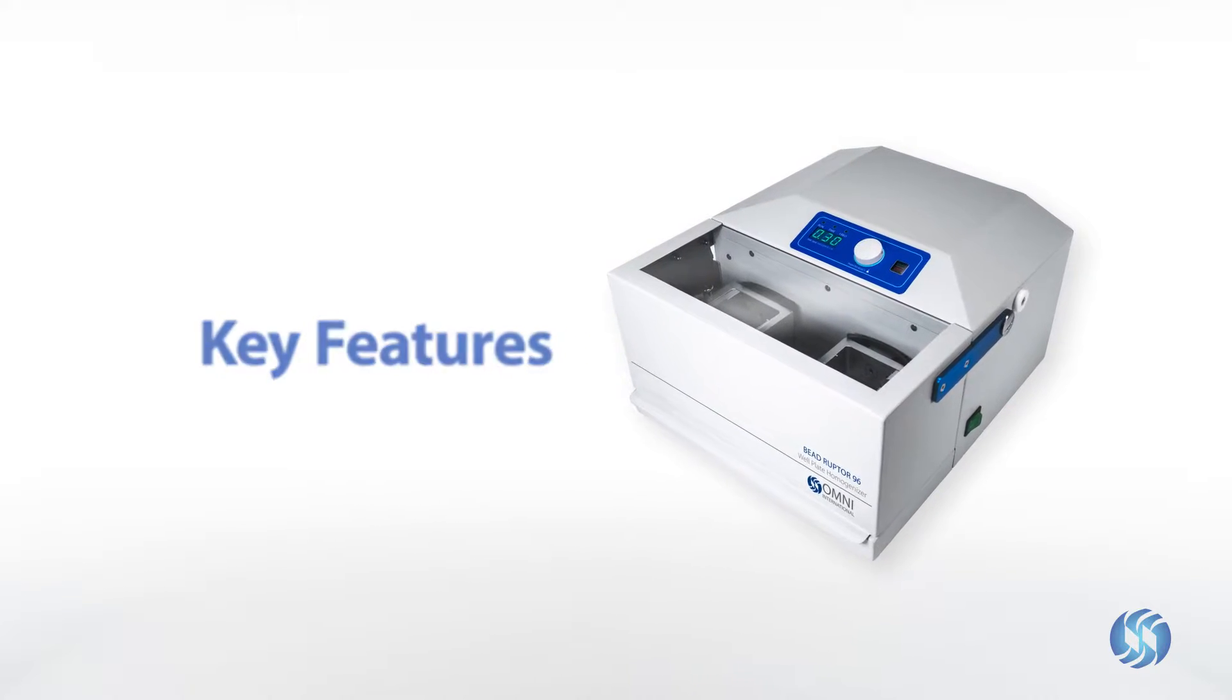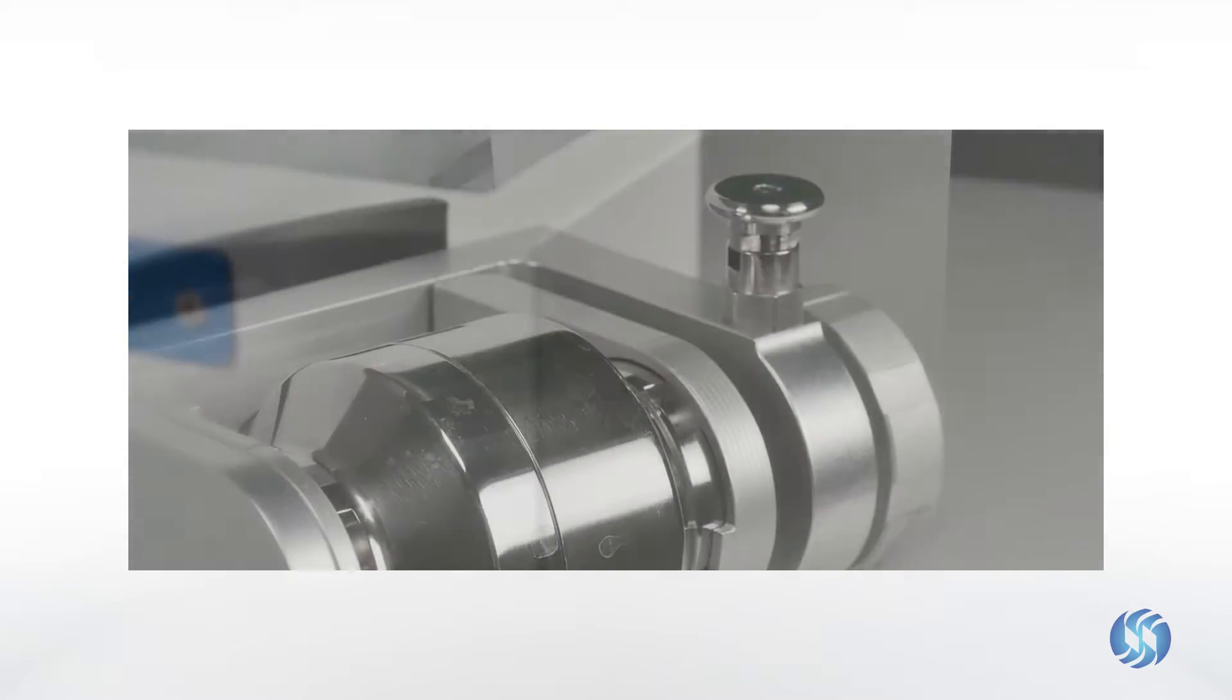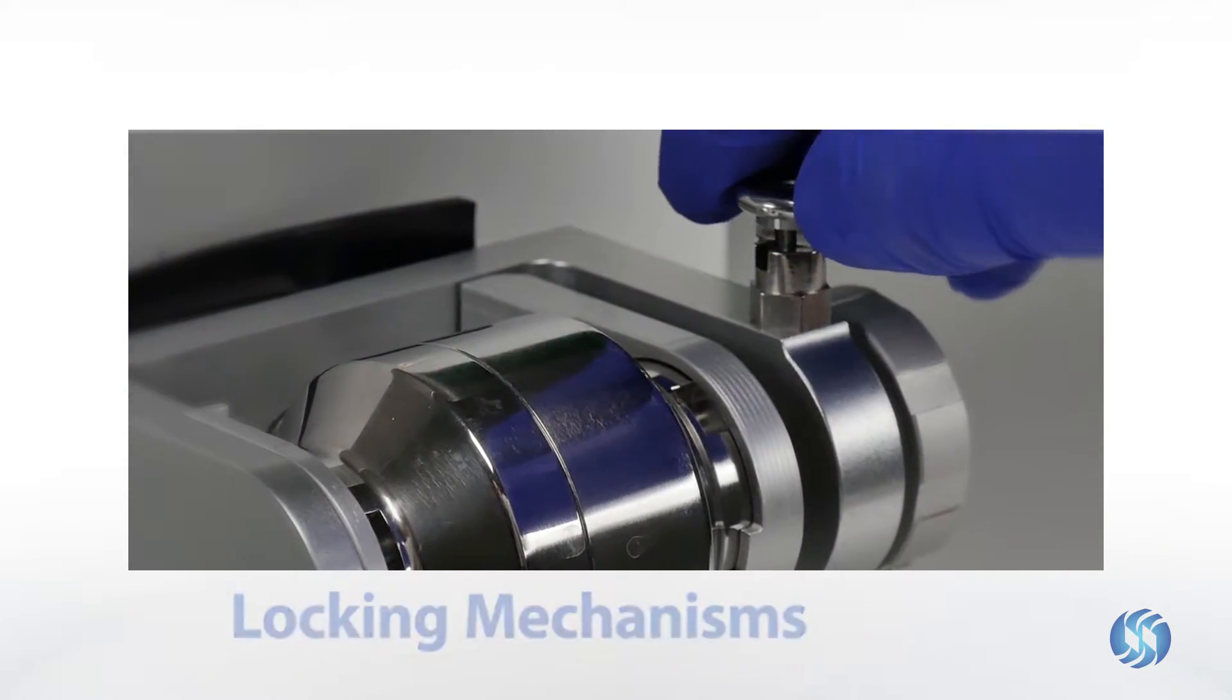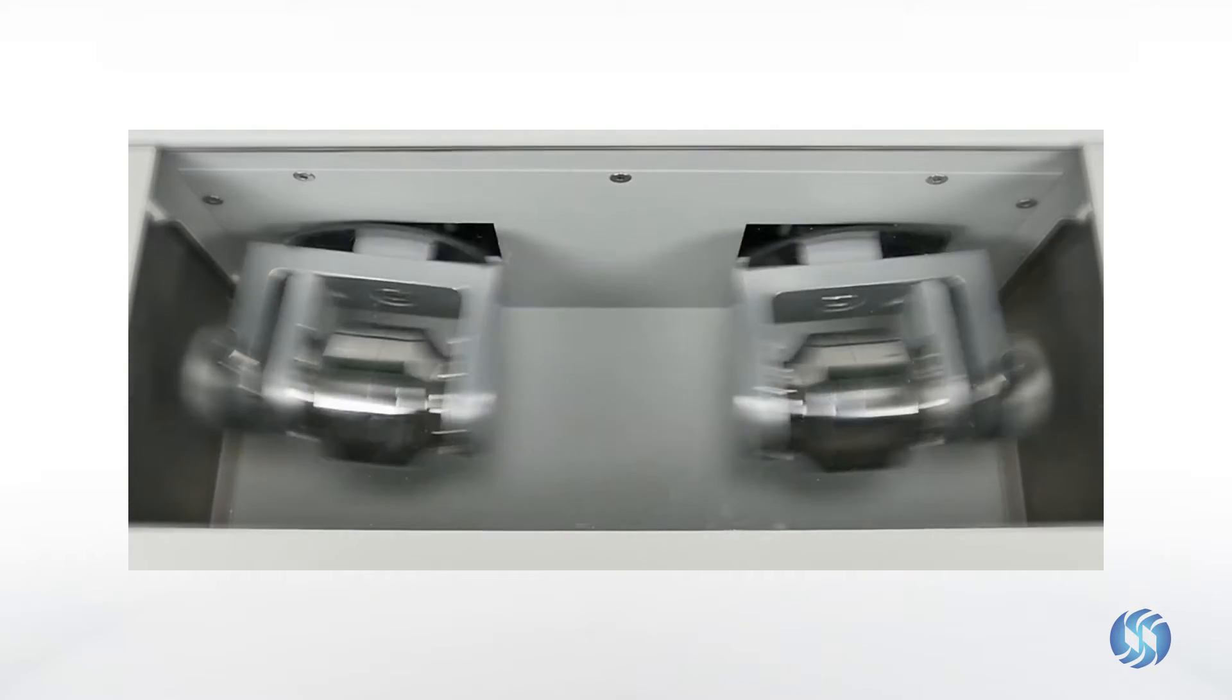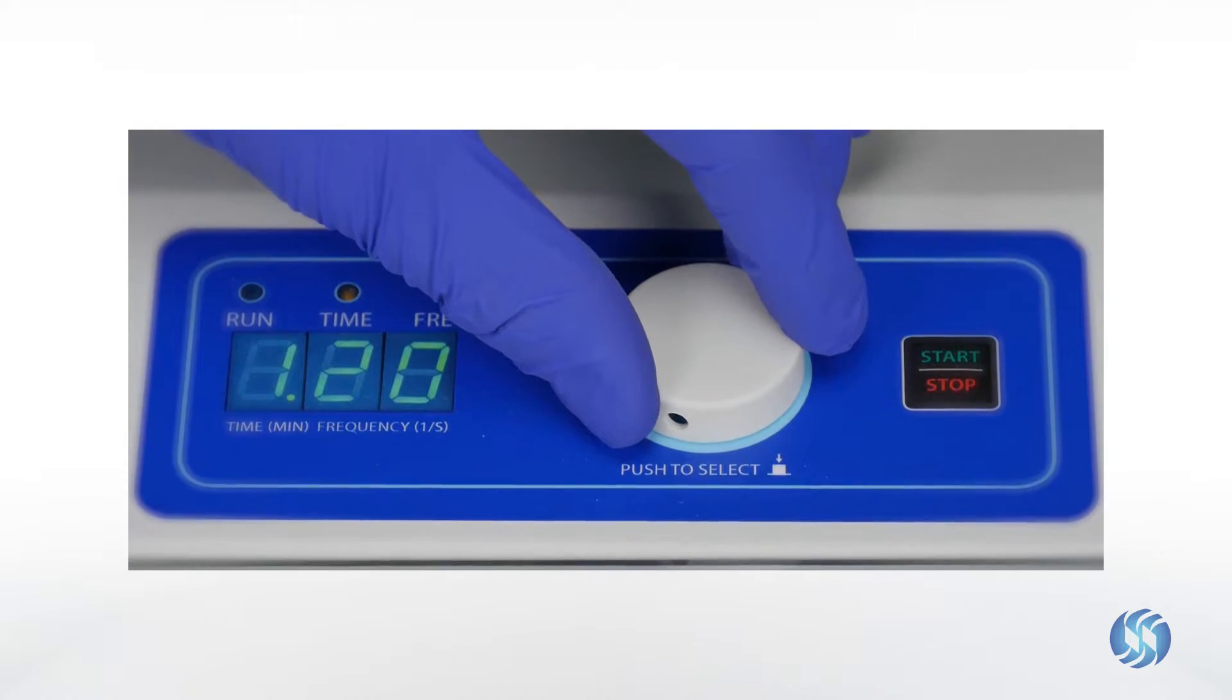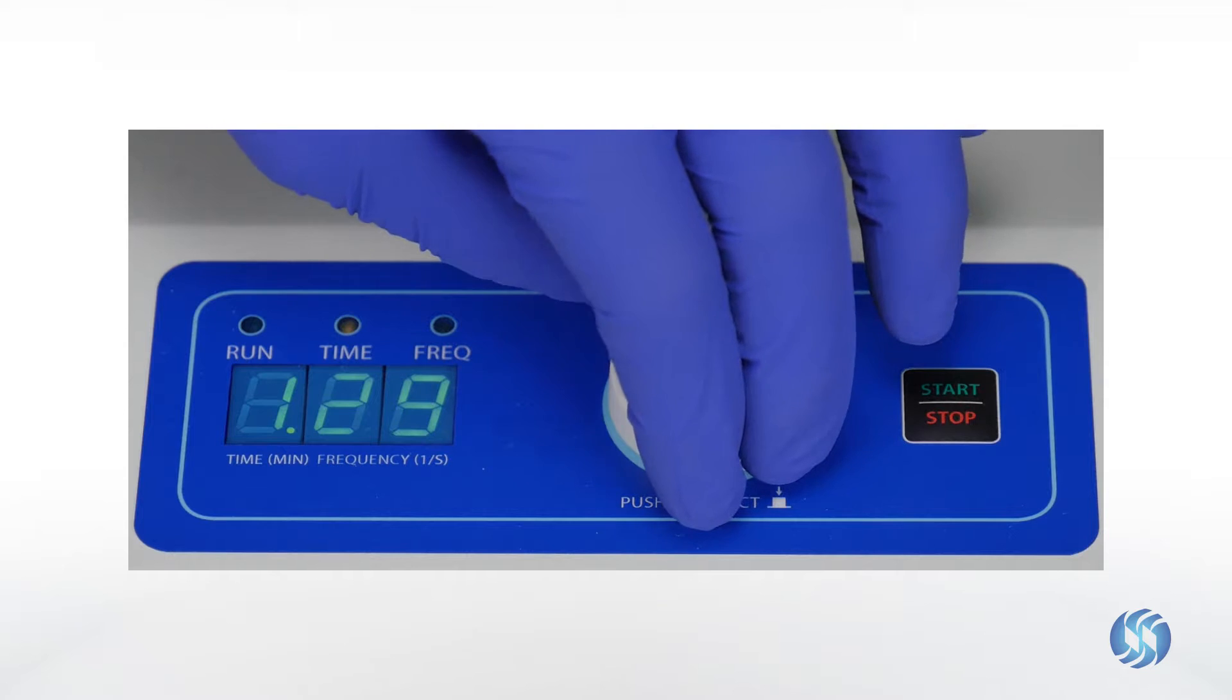The Beadruptor 96 ensures safe operation through lid closure detection and processing attachment locking mechanisms. Large processing swath results in high bead impact forces to reduce processing times. The Beadruptor 96 also features digital controls for reproducible processing.